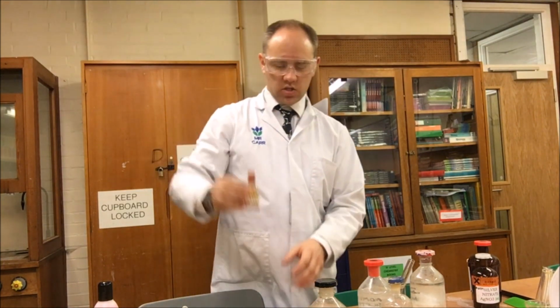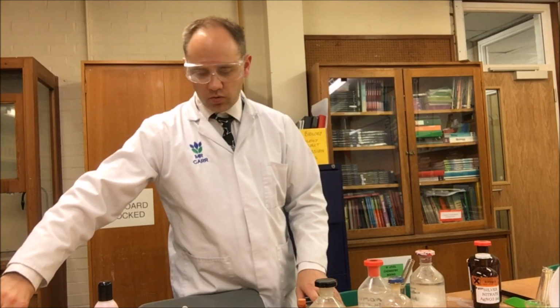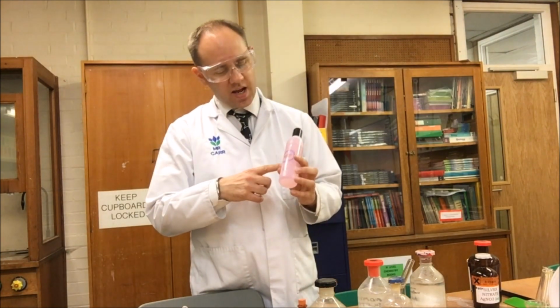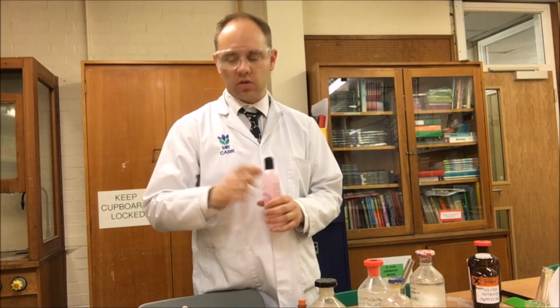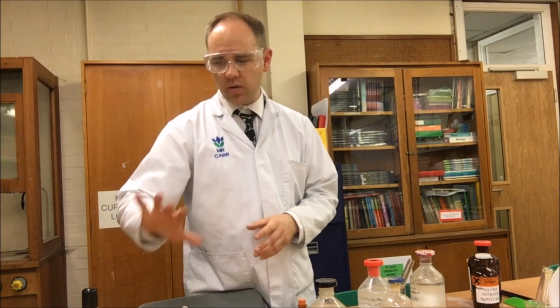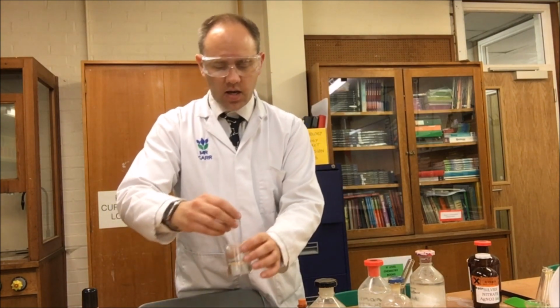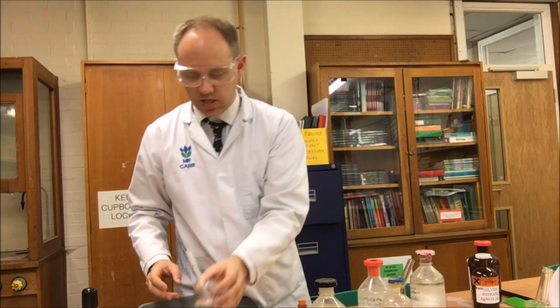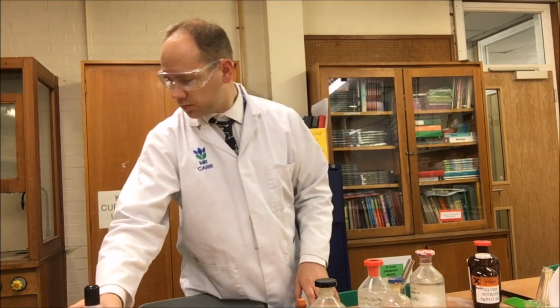It's called Brady's reagent. It's 2,4-dinitrophenyl hydrazine, and this will react with the carbonyl group that's present in acetone, which is what ladies and I guess other people use as well to remove nail polish from their nails, as well as actually remove the false nails themselves. And in here I happen to have a dissolved sugar, just ordinary sugar that you put in your tea. Now, the glucose itself is an aldehyde. Acetone is not an aldehyde, it is a ketone.